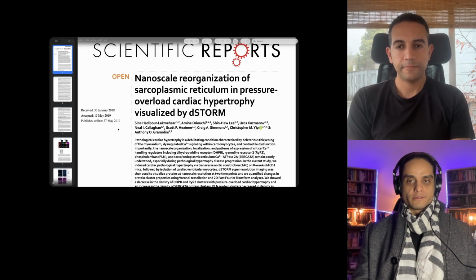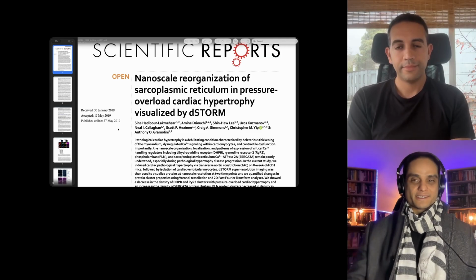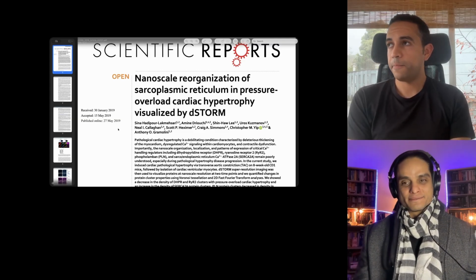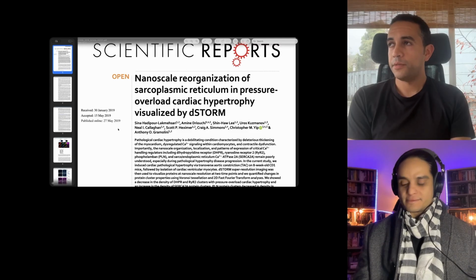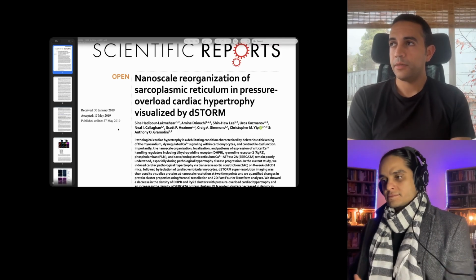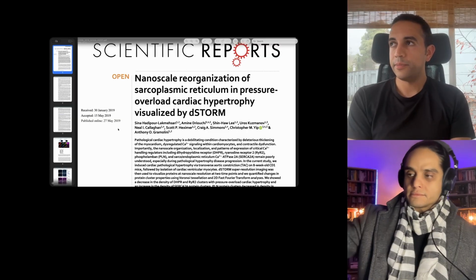Okay, so how do you manage that? Do you get a more powerful laser? That's one way to do it. There are other methods that are more elegant than adding a cylindrical lens.